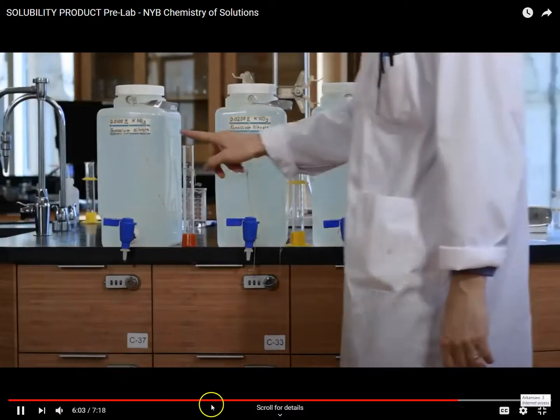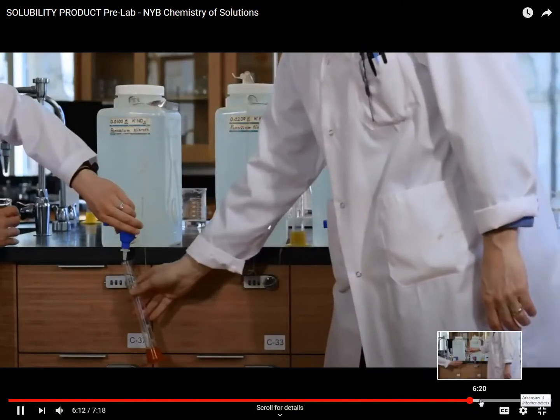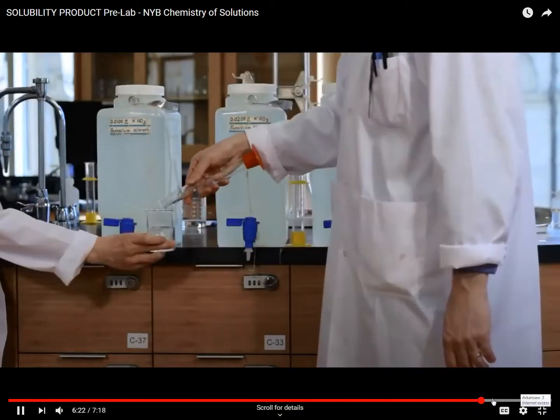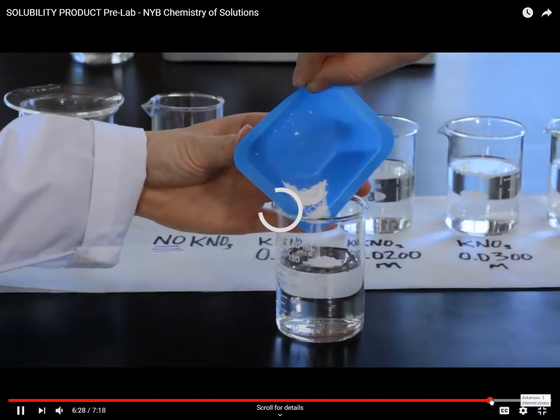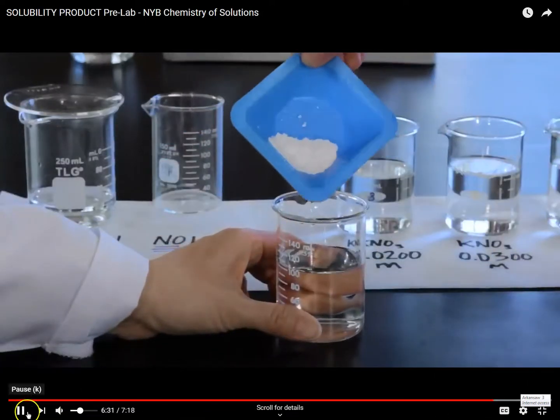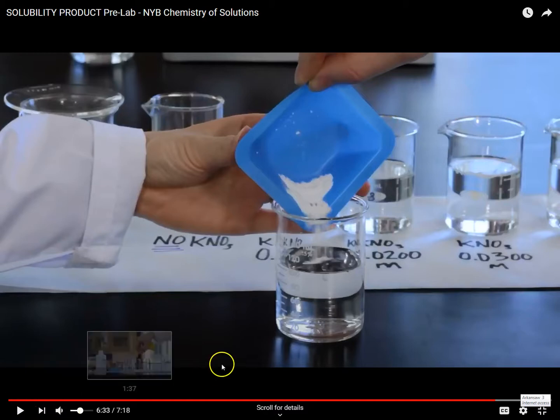Record the concentrations of the 4 potassium nitrate solutions. 100 milliliters of a potassium nitrate solution will be used as a solvent. Okay, so the first one was deionized water, just like what we are going to do. The next one they use potassium nitrate. We are using potassium chloride. So this right here then already has a common ion in it. 0.1 molarity potassium chloride in our case.